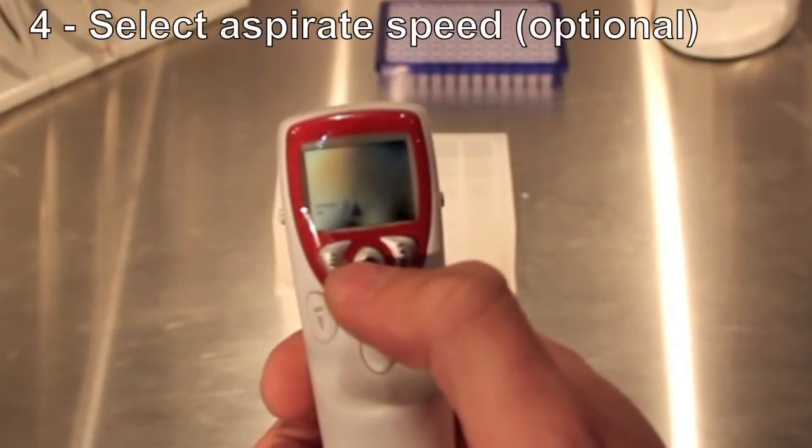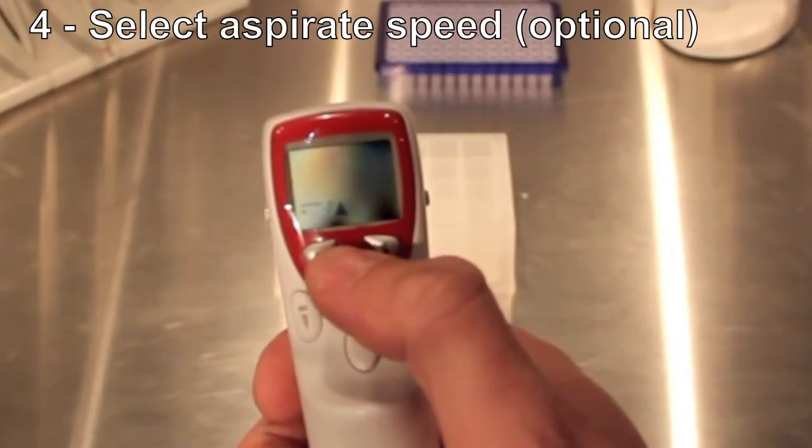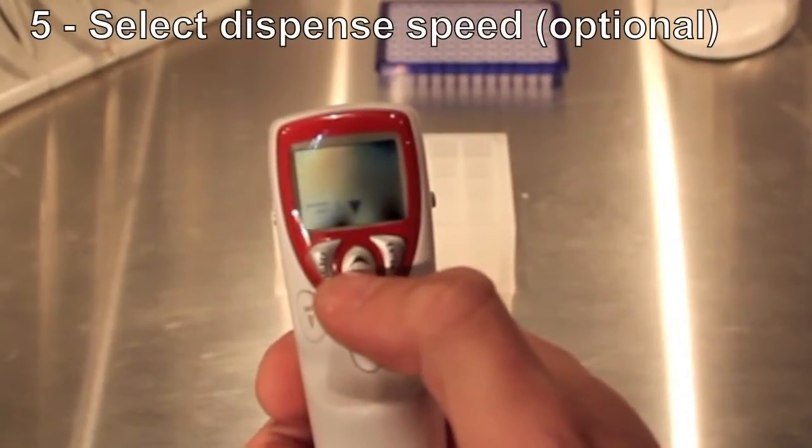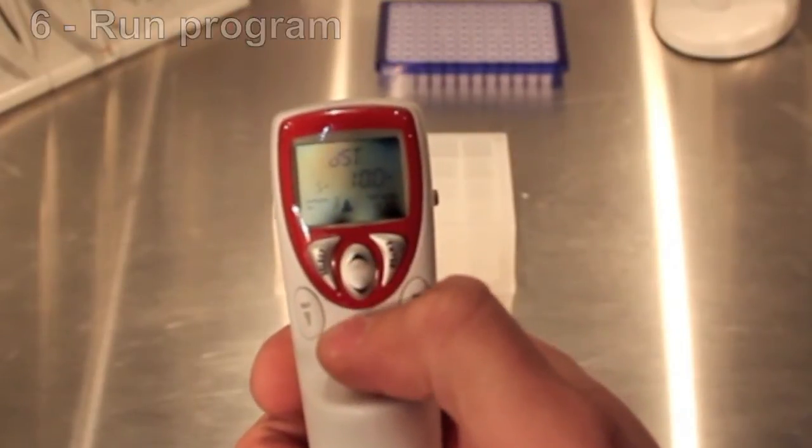There are a couple of optional settings, which include the aspirate speed as well as the dispensing speed of the unit. Once you have completed your program, you simply press the center button to run it.